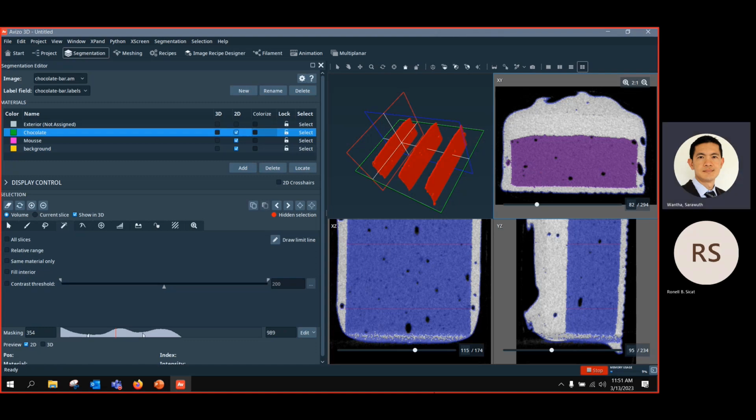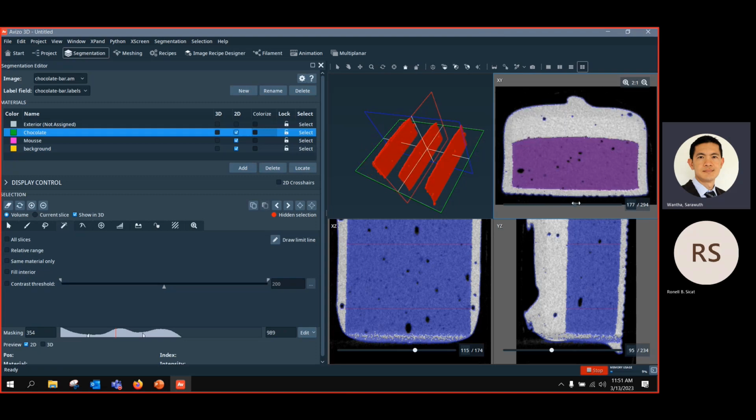You want to segment individual teeth, so you go layer by layer, and you see that most teeth sometimes have a gap. So you can select individual teeth, interpolate them, and use this interpolation for watershed segmentation. So that's an application of this magic wand tool in combination with the segmentation workflow and watershed segmentation.